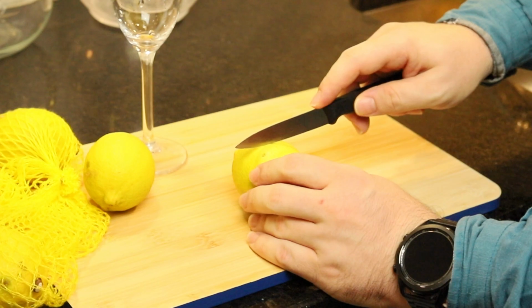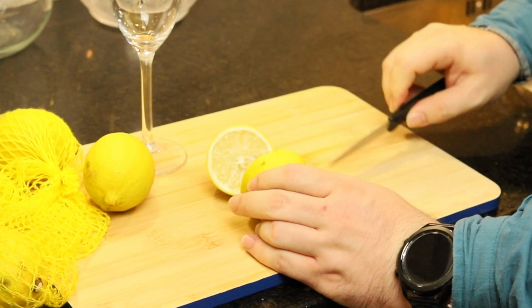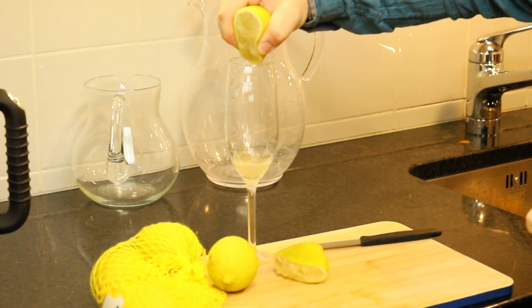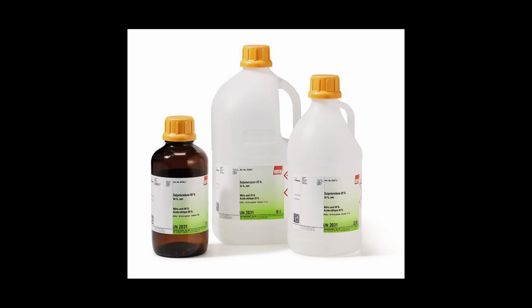I didn't see any results here either, so I gave up on these solutions, and I went for nitric acid. Nitric acid is basically the equivalent of having something called soft water, which is water that is very acidic. It's not exactly the same, but it's somehow equivalent to speeding up having the glass in this type of water for many centuries.